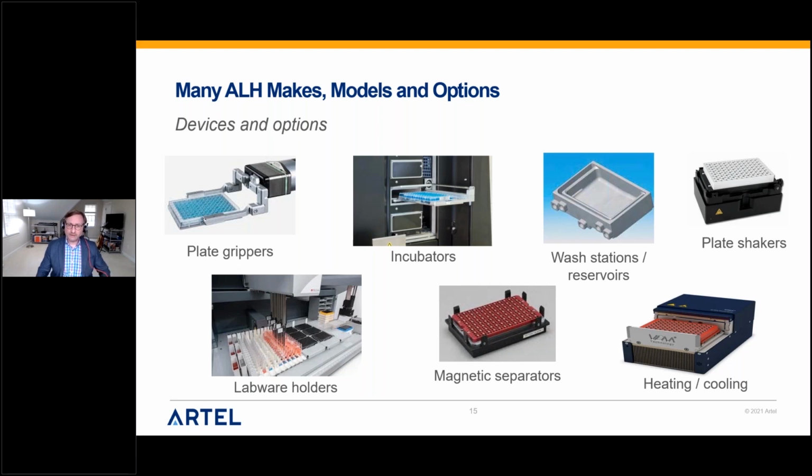But this is why they're asking, because a lot of these are options. You don't need it. But this is where I was going at, trying to describe earlier. When you're thinking ahead, it may be cheaper to get the options now if you think you will be using this equipment later. So in other words, if you're doing an ELISA, which you don't need a magnetic separator for that, but you're planning on doing some qPCR work in the near future, think ahead. And then you might want to include the magnetic separator and then maybe a plate gripper or something like that.